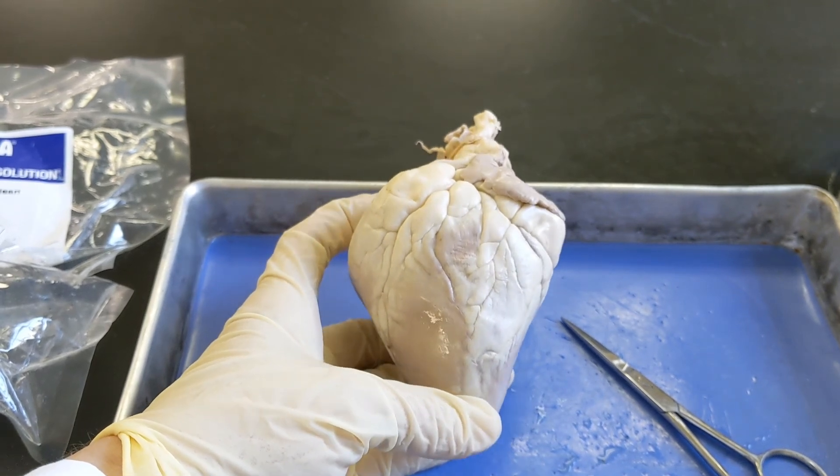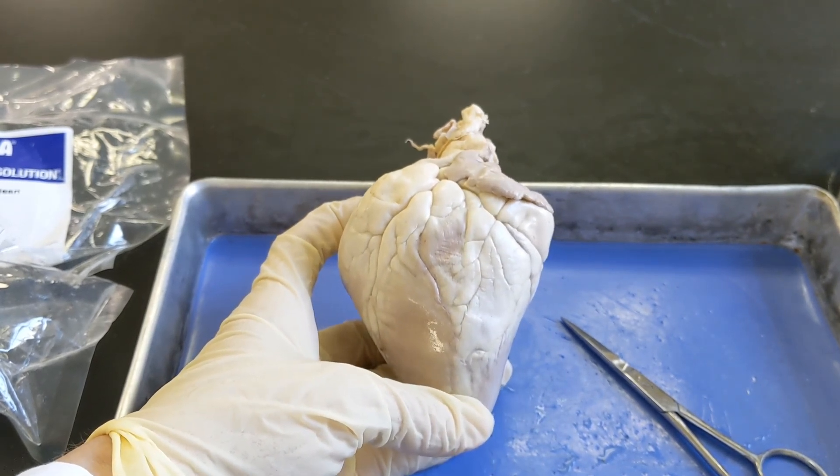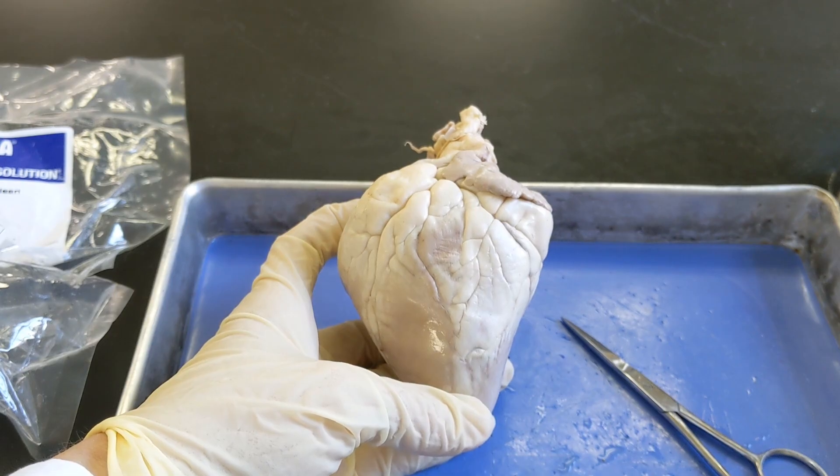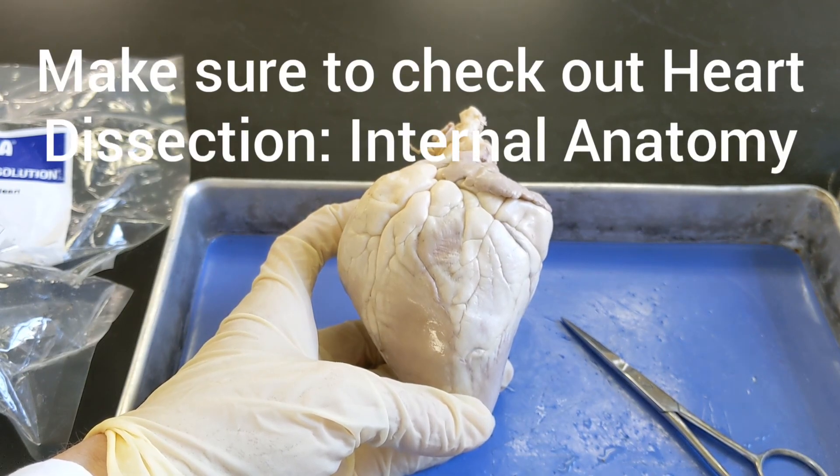The next step is going to be to bisect this heart — to slice it down the middle to separate the front from the back. You can go to part two of the video if you want to see the internal anatomy of the heart.